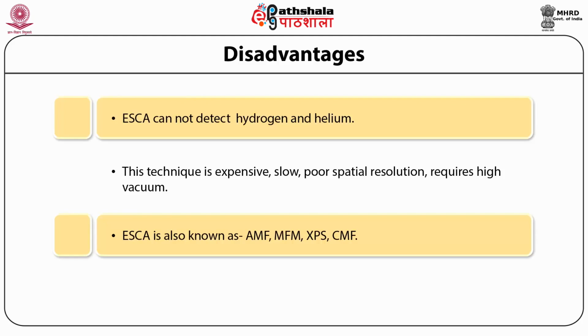Now this can definitely tell us about the approximate strength or thickness of the adsorbed layer, but precise measurement regarding thickness cannot be estimated. And the other disadvantage is that this is a destructive technique. Whatever sample we use at the surface does not stay intact.